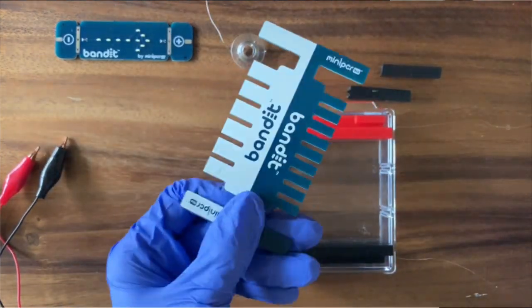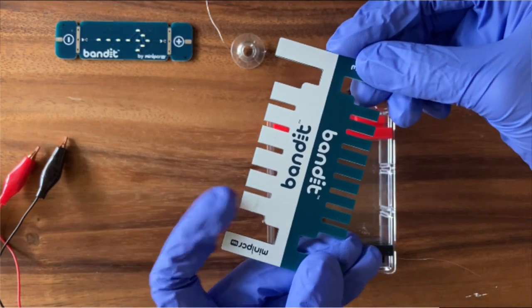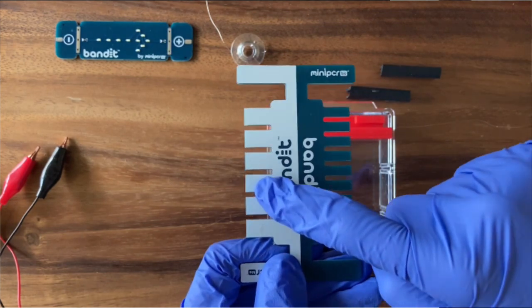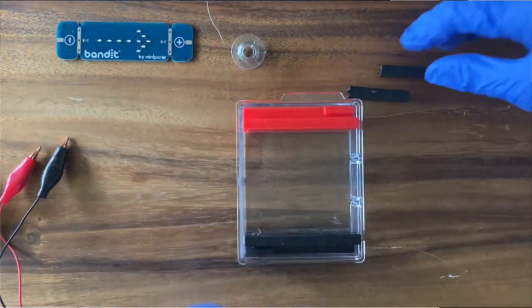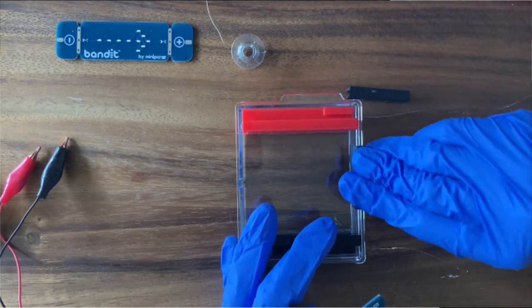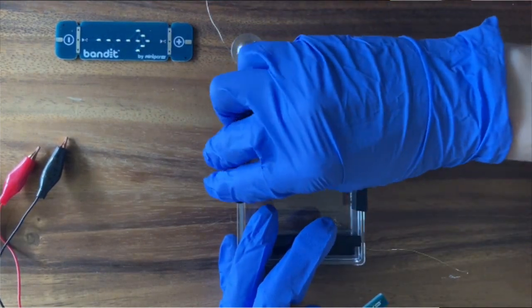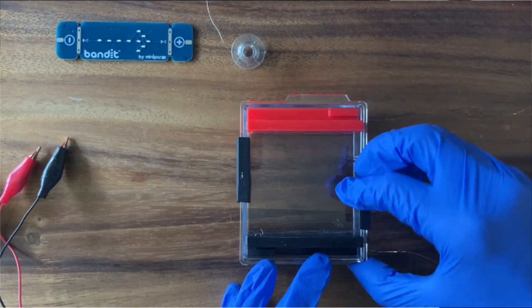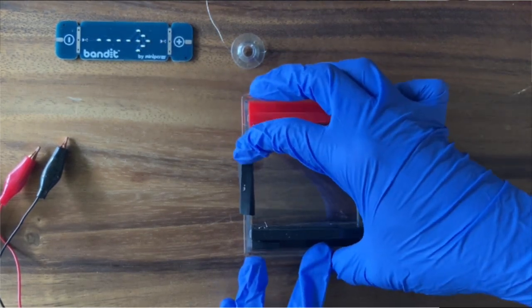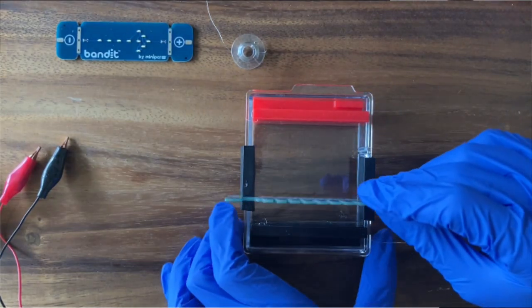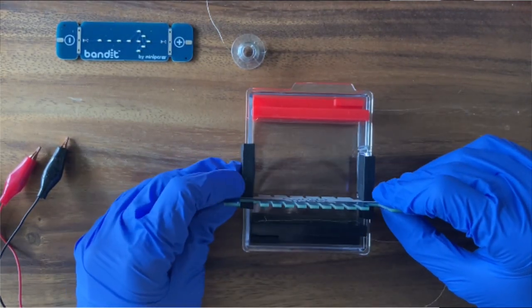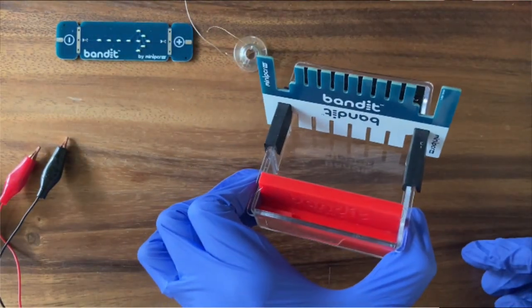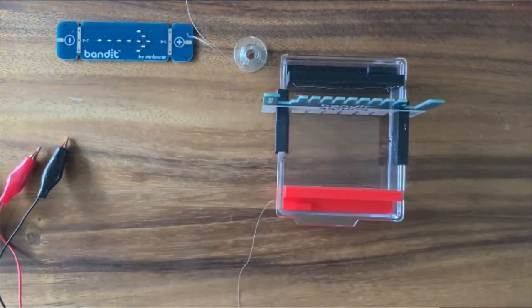To make our wells, we're going to use this comb. Each tooth of this comb is going to make one well. The Bandit comb has a side that can make nine or a side that can make six wells. We're going to use the six well side today. We want our comb to sit up and make pockets. These comb supports go on either side of our buffer chamber and they'll suspend our comb in the molds. If we don't have these comb supports here, the comb teeth will hit the bottom of the buffer chamber. That'll lead us to create holes in our gel rather than the pockets that we want. That is our Bandit system in casting mode.